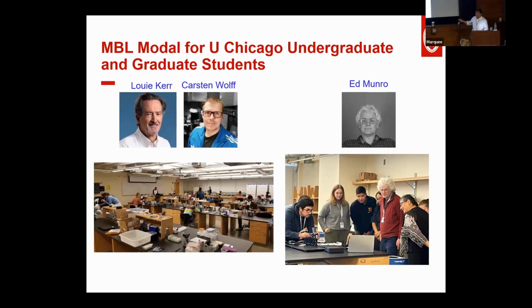With Ed, I designed a course for graduate students. Basically it was a 2 week microscopy boot camp for UChicago graduate students. They're all cell and molecular biology graduate students. And again, like AQLM and OMIPS, we started with this optical rail system to build this microscope and get their hands dirty.